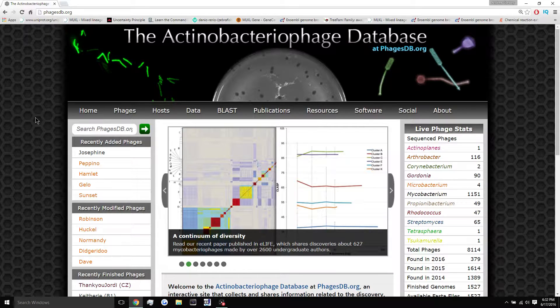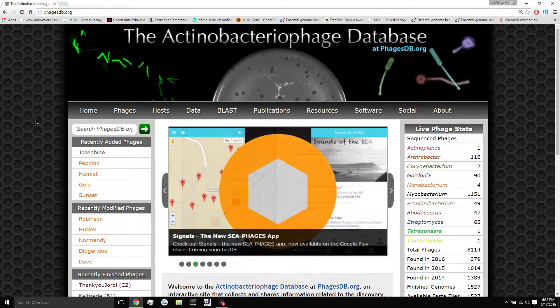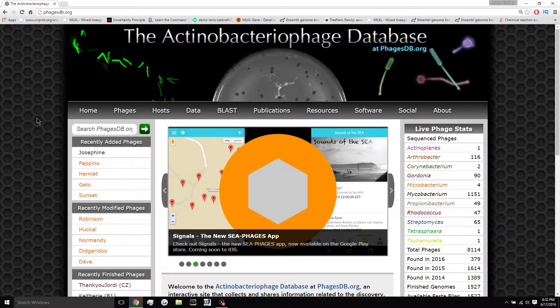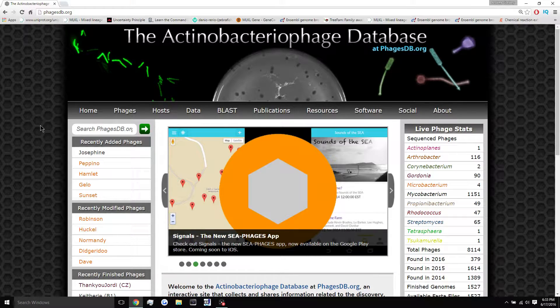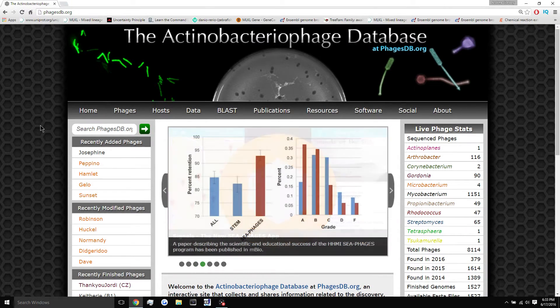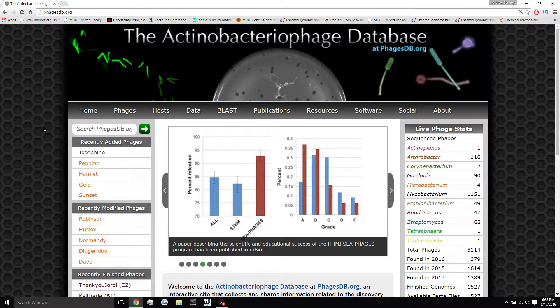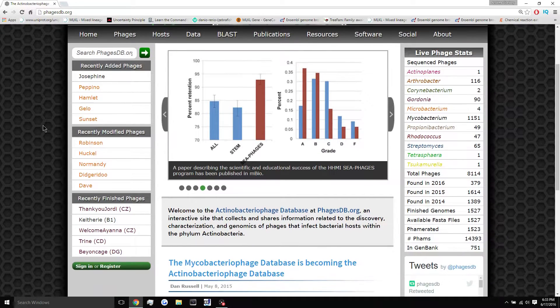Now if you're using a Mac, this is not going to apply to you. I will make a separate video showing you how to install it on a Mac. It's a little more difficult. You're going to have to run a virtual machine because DNA Master only works on Windows.